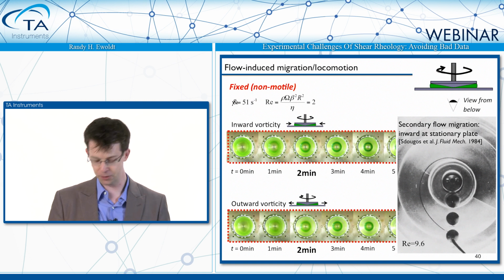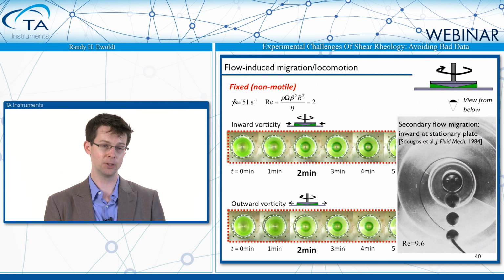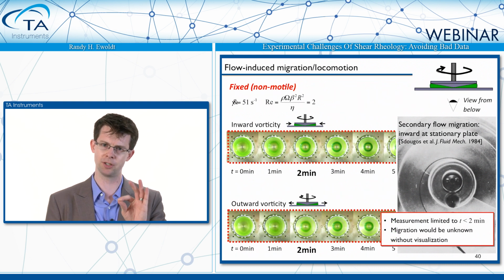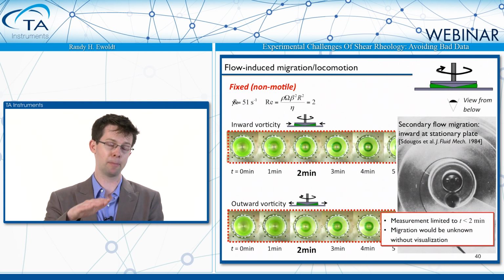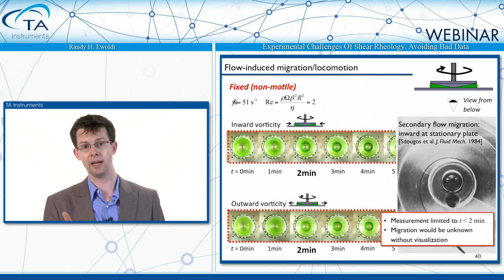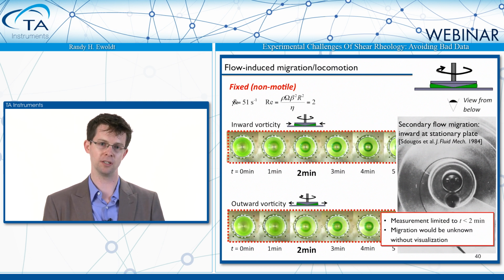I think this is a good call to us to take a better look inside of our material when they're being tested to really see what's going on. It'd be very difficult to make this measurement without seeing what's going on inside. The changes were very subtle. I didn't have a chance to change the gap because it was measured with a cone and plate. And so what I needed to do was look, and what we identified was that if our measurements are taken within the first 2 minutes, we were okay because we were still approximately homogeneously suspending these microalgae.